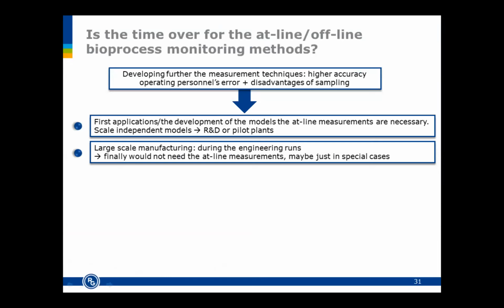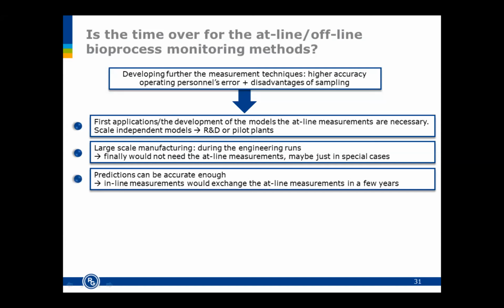So if it can be proved that the predictions can be accurate enough in order to apply them in the process, then I think the inline measurements would replace the at-line measurements in a few years.